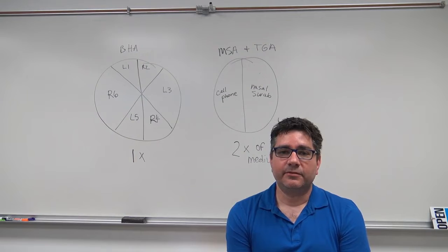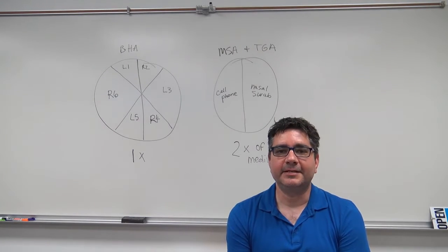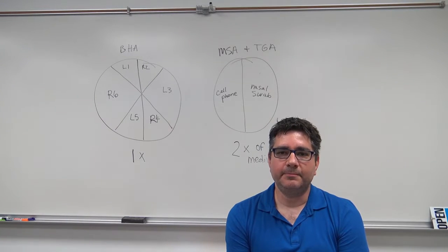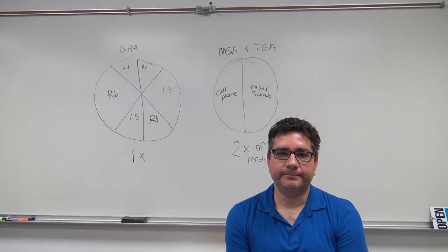Now let's discuss the three types of mediums you will be working with today. The first medium you'll be using to conduct the hand washing experiment is the brain-heart infusion medium. This is a general purpose medium that is highly enriched. This medium will not inhibit any microorganisms and will provide for a suitable medium to allow you to detect the presence of microorganisms before and after hand washing.